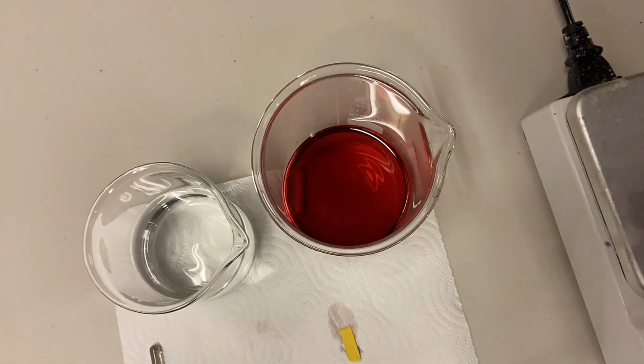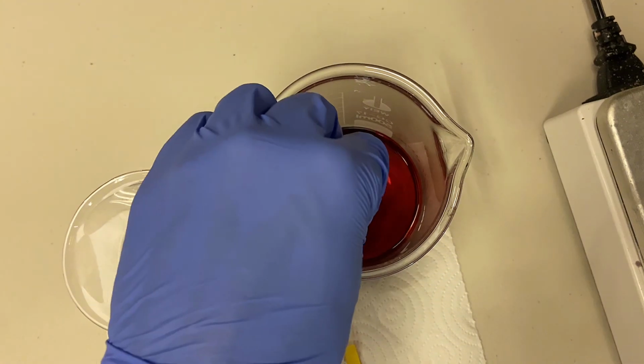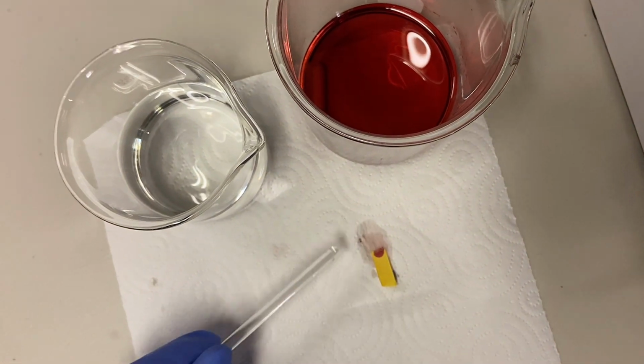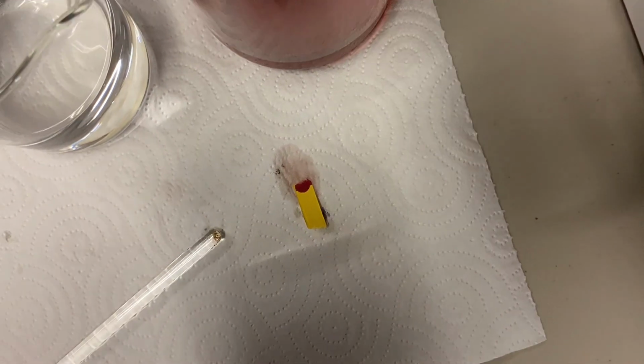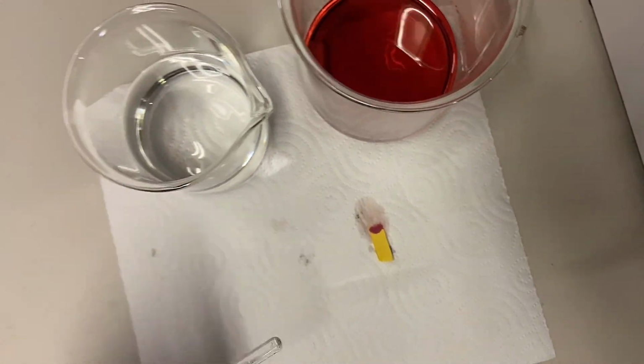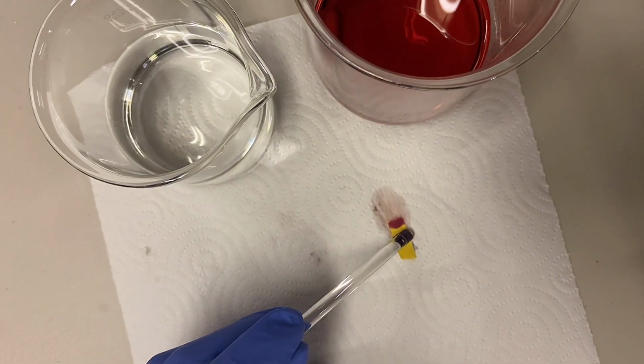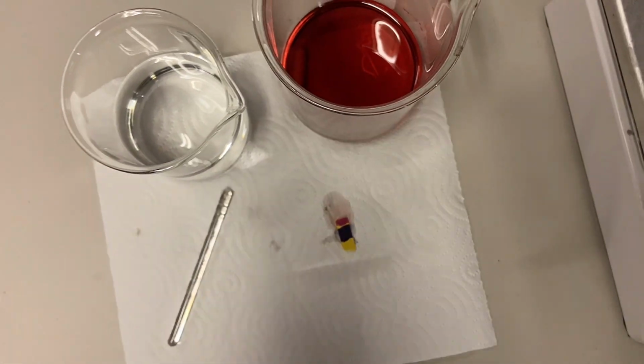Now, before I move on to actually getting the manganese out, this needs to be neutralized. So currently it is very acidic. If we just give it a quick probe here on the pH strip, you can see that's very, very red, very acidic, as opposed to this, which is a hydroxide, which is very, very basic. So it's a nice blue color.